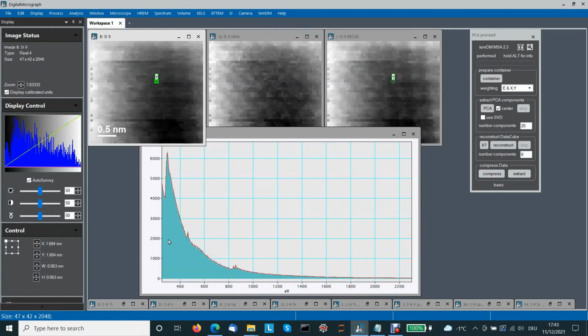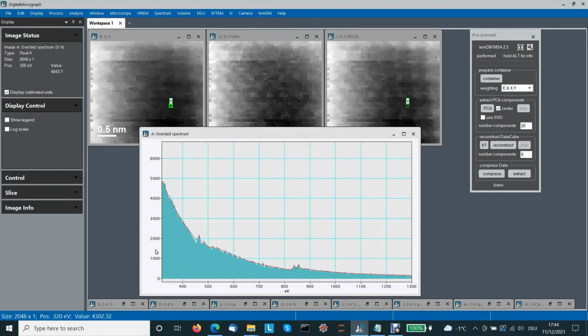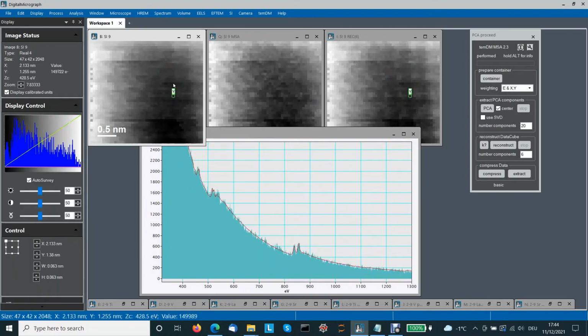I mean, the full spectrum is original data, and the red line is the reconstructed data. First of all, you see that the reconstruction generally follows quite closely to the original data. But if we zoom a little bit, we see that the reconstructed data are much improved, denoised. And that is quite good, and that is what we wanted.